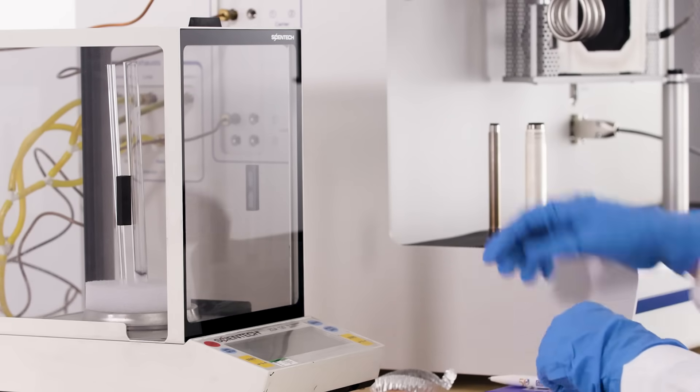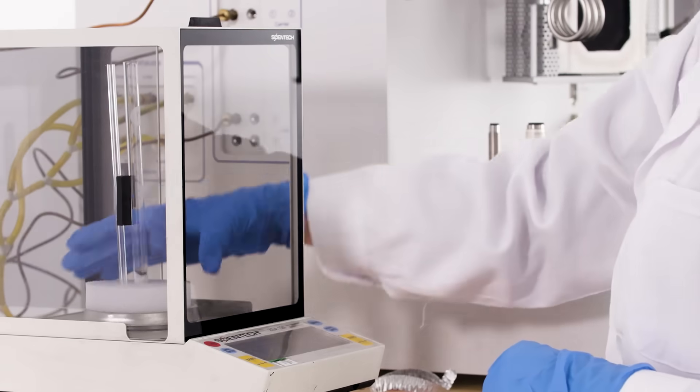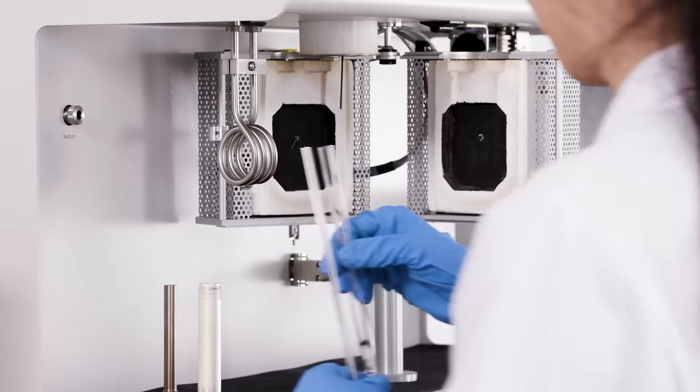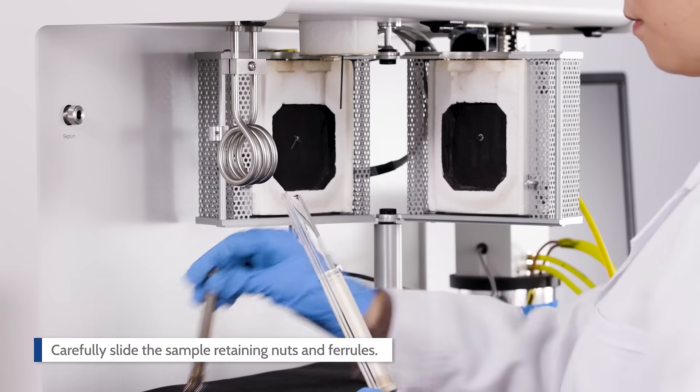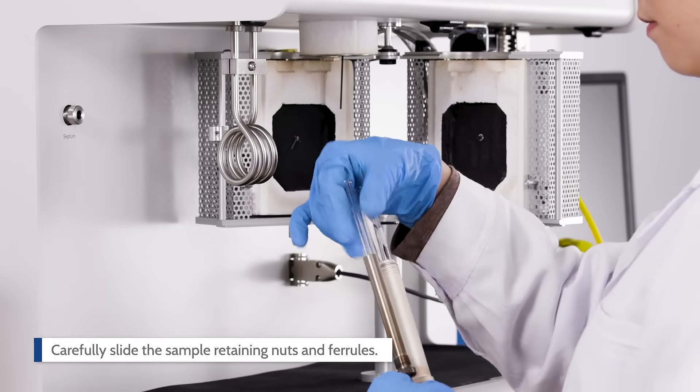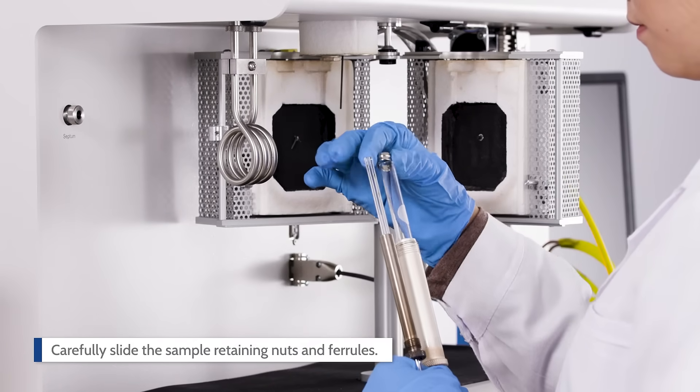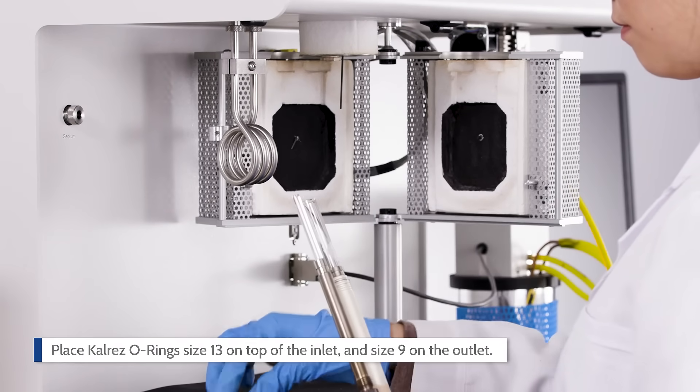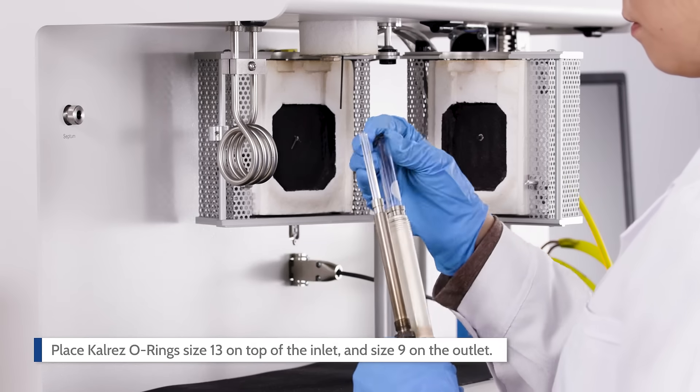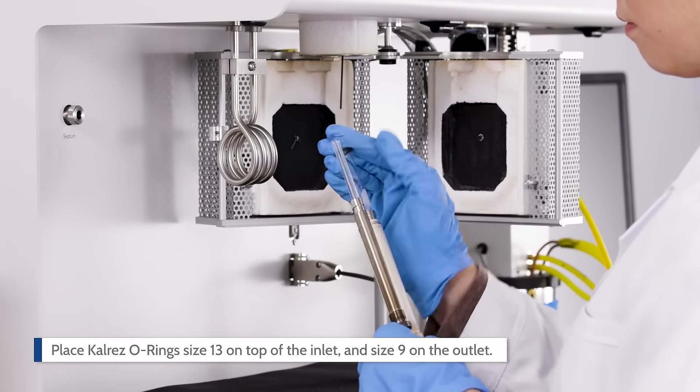Carefully slide the sample retaining nuts and ferrules over the inlet and outlet of the sample tube. Place CalRes O-ring size 13 on the tip of the inlet and size 9 on the outlet.